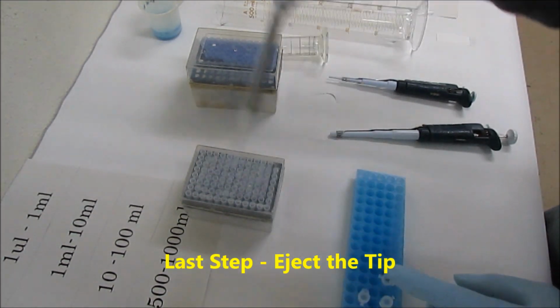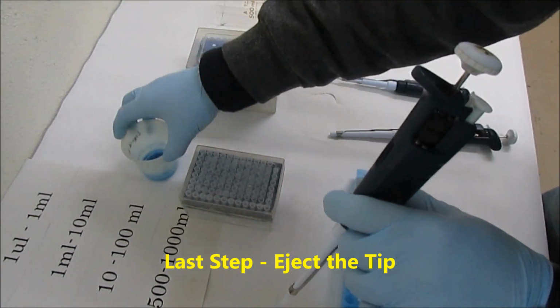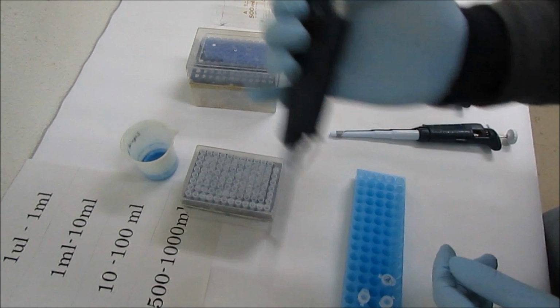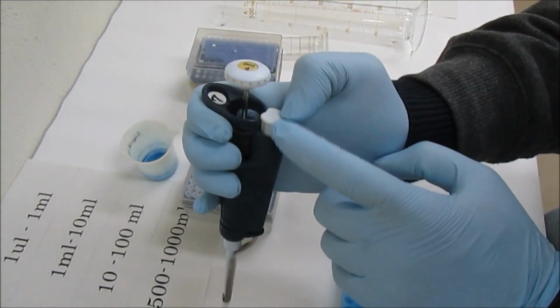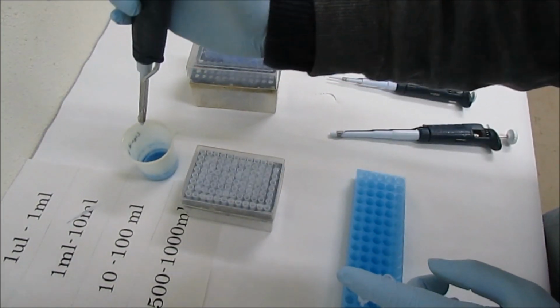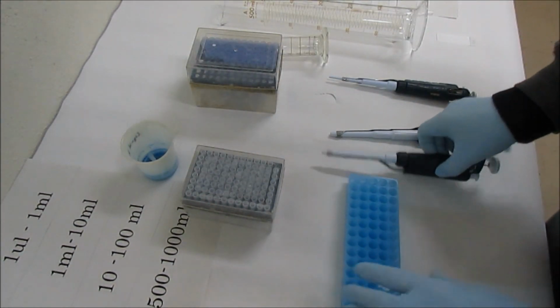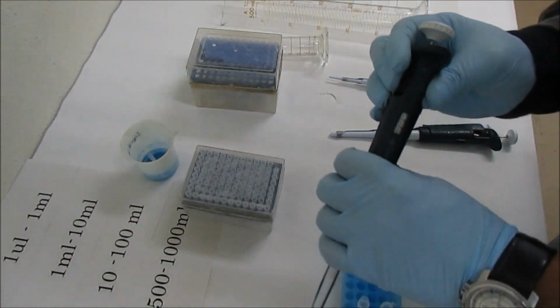Now we need to change the tip, because every time I need to measure different liquids or different volumes. Just use the ejector, this part, just click. See, very interesting how it works.